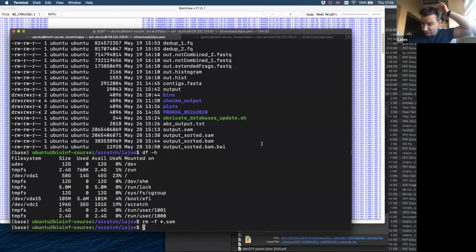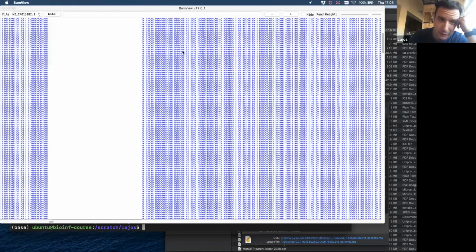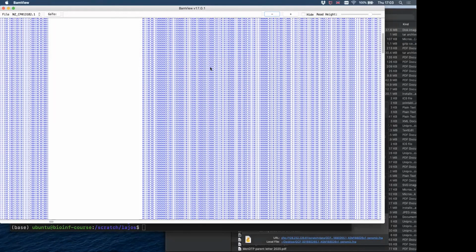Right, any questions? I just have a little question. I don't know whether you said it. Oh, maybe I lost that. But what do the reads that are in black mean in Artemis? Does that say anything? Yeah, I think in the BAM view, the black lines are the ones which are not paired. Ah, okay. Because you also see the pairing sometimes.